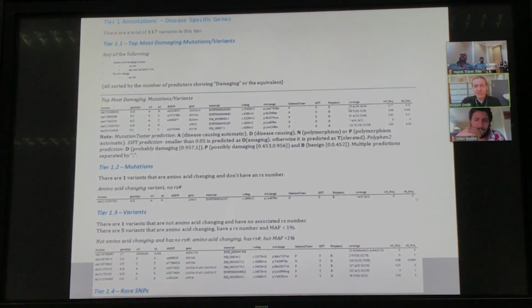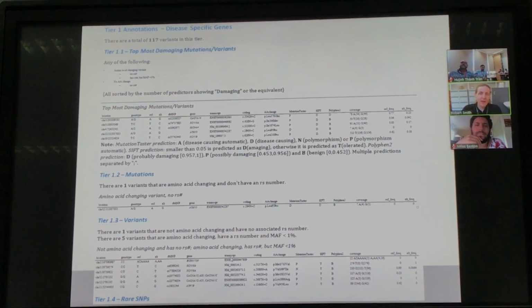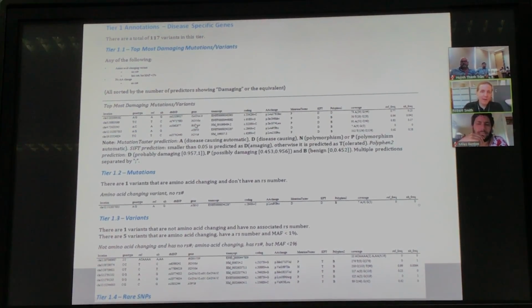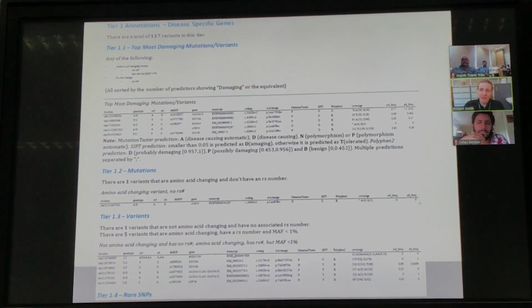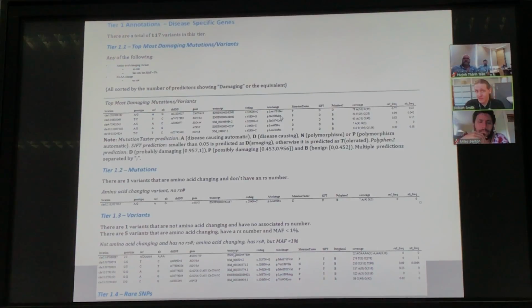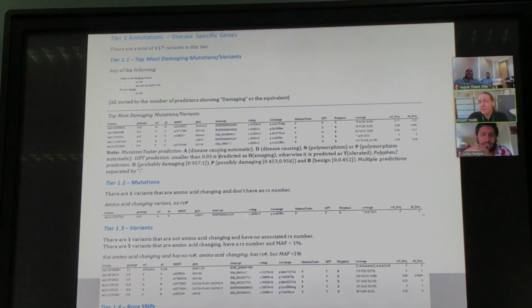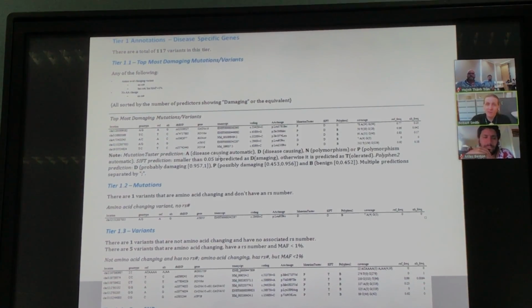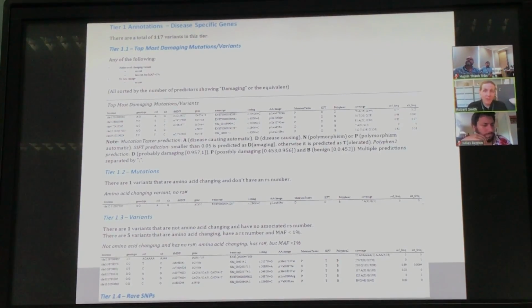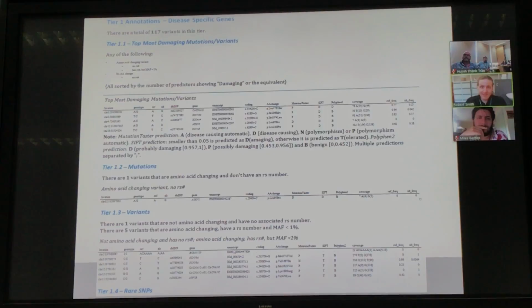We get coverage statistics here, which can let us know whether we think it's a true variant or not, whether there's something else going on. And it gives us an idea about what the alternative and reference frequencies are for the variant. And these ones are actually relatively common, but because this is considered damaging, it appears under this damaging tier. And it's possible for the few rare SNPs that do have fairly high frequencies to be damaging. An example of this with a different gene set is the gene ApoE, which is somewhat common and still causes disease.